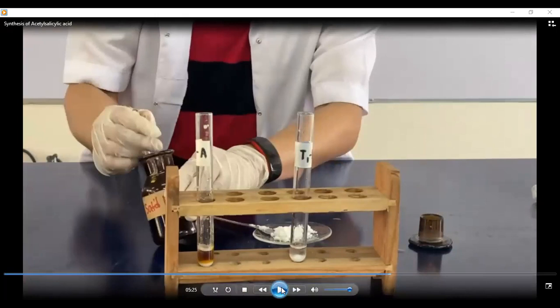So, the ferric chloride solution is dirty yellow or yellowish in coloration. So it should retain its color, which is good or true for the lab available aspirin.